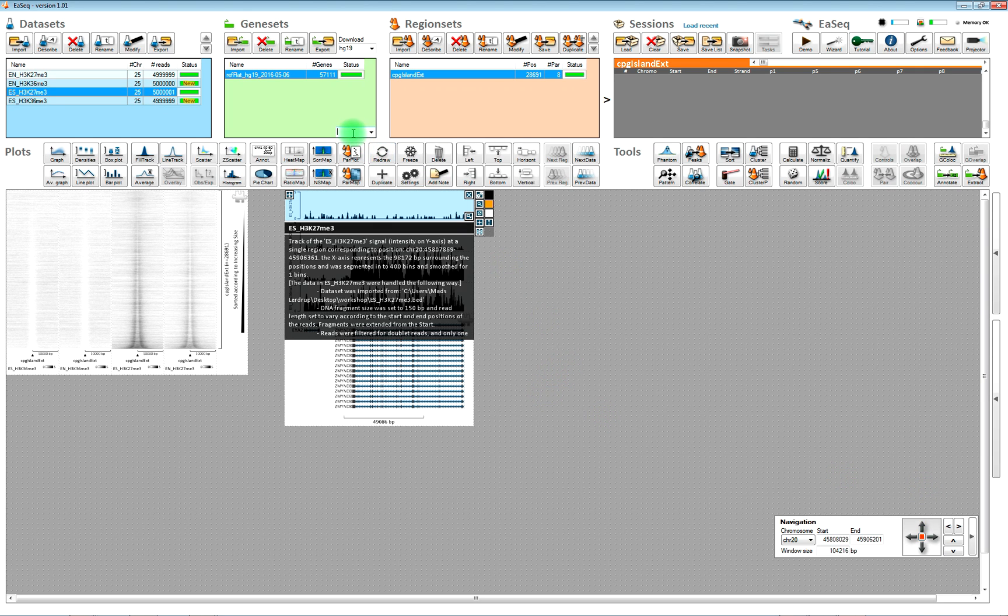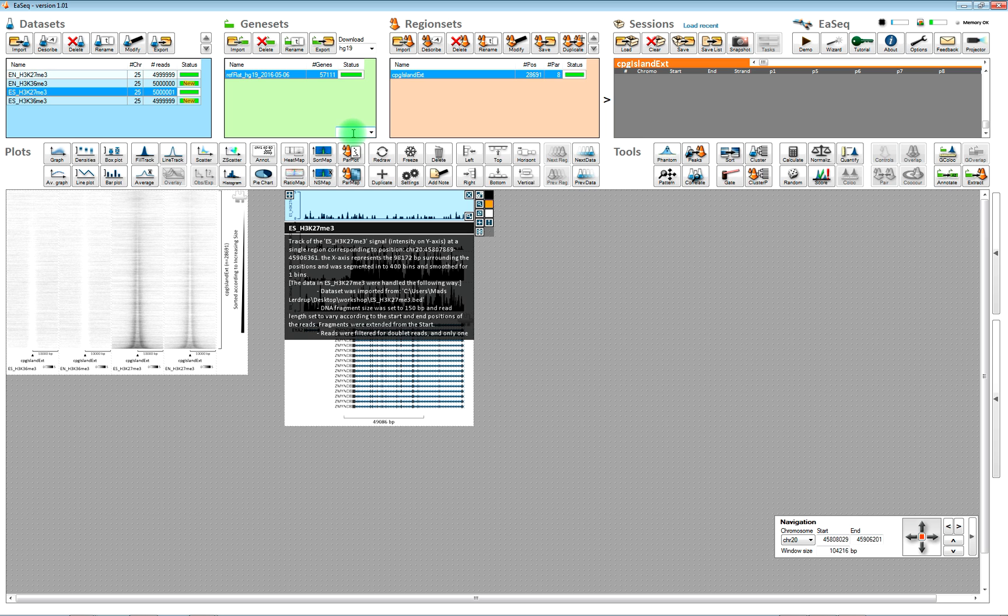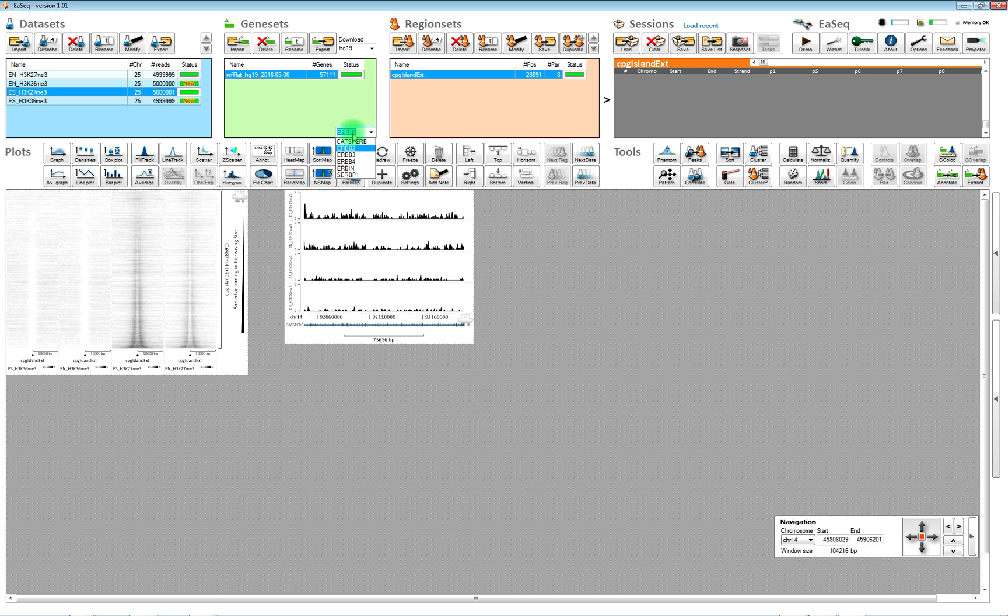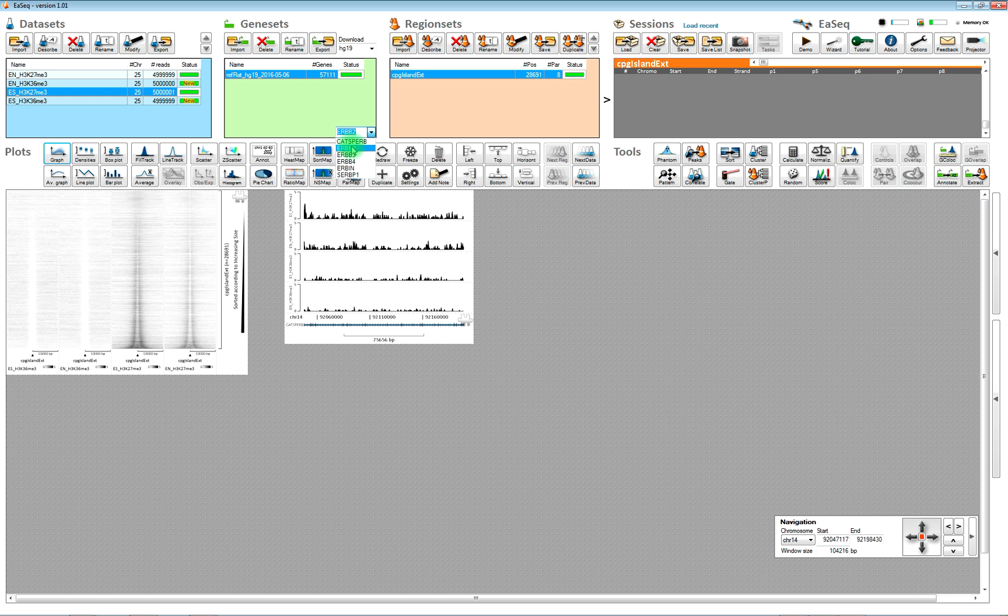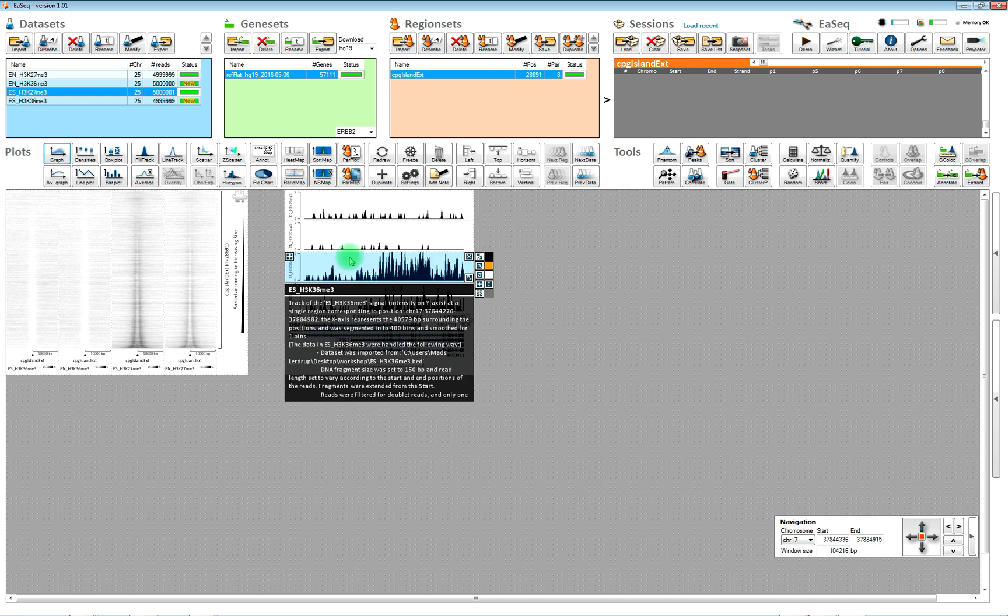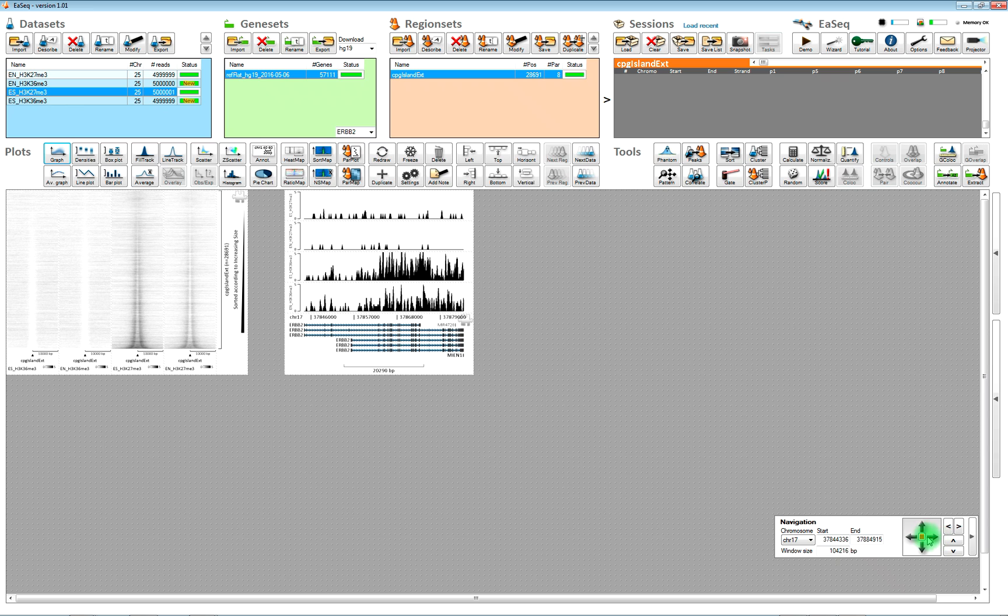And we can also go to a particular gene just by typing the name. Now we can go to ERP2. Then you see the locus here, the ERP2 locus.